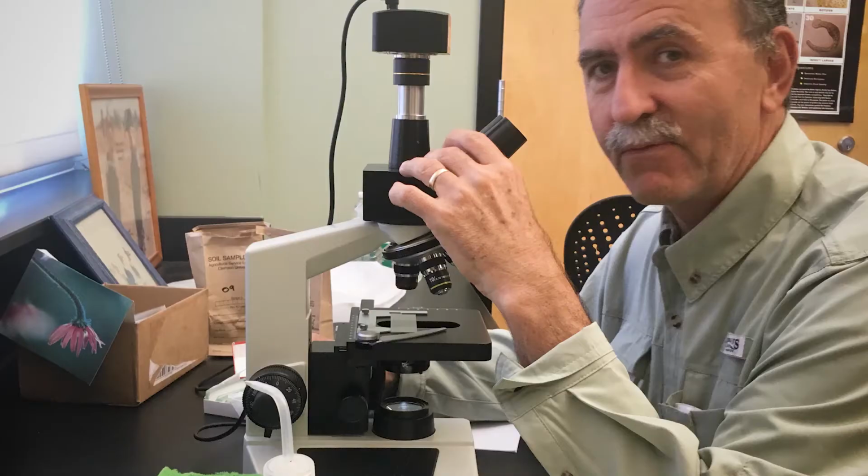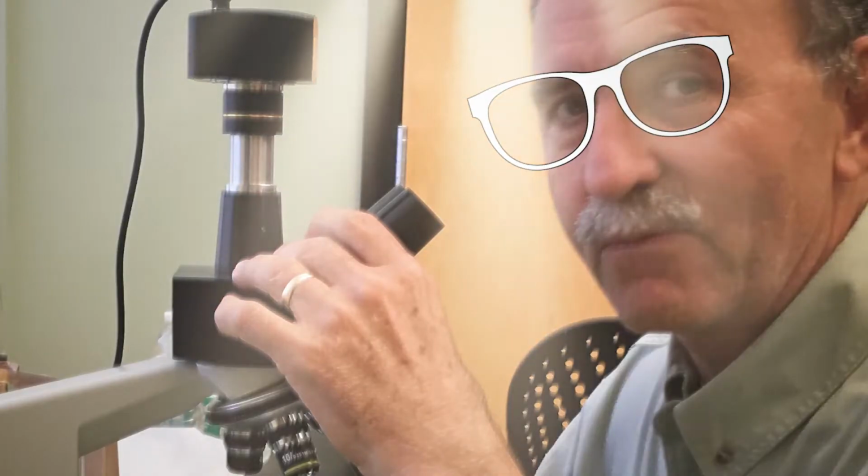And I'm Gabe Kenne. And we wanted to geek out a little bit again this morning, just talking about the PLFA and giving you some information on that. And we're going to spend the next 2 or 3 videos talking about it. So Gabe, give us an idea of what PLFA is.